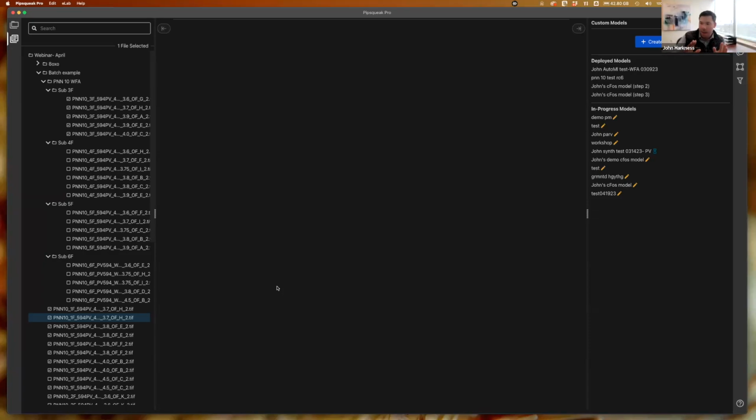So I have been droning on for a very long time. Hopefully this has been helpful to see a lot of the different things that this program is capable of doing. Really our thesis is that we want to make Pipsqueak as powerful and as broadly applicable as possible. This is really designed to perform detection and quantification capabilities across a lot of different image types, across a lot of different staining types. So, hopefully this is something that you think would be useful to you and your workflow.